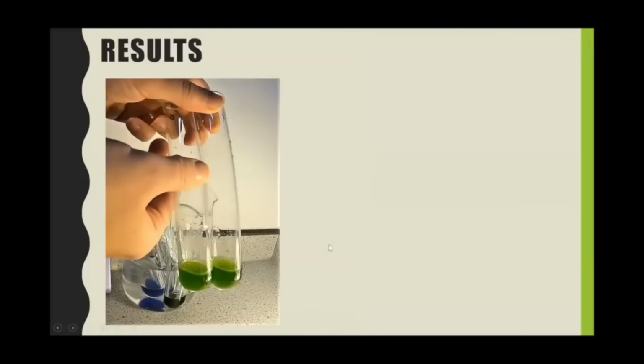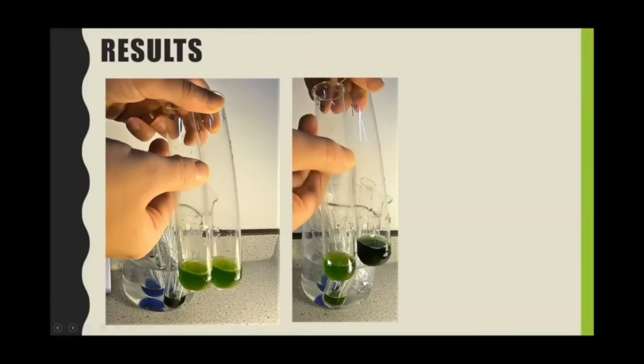My actual results: here I am comparing the X test tube, which is experimental tube 1, with my standard test tube, and I can see they're now exactly the same colour. So the DCPIP was decolorized, and that was the endpoint of my reaction. Experimental test tube 2, this is the start colour. It never actually changed. It's still got that dark greeny blue because it's a mixture of the blue DCPIP and the green chloroplast suspension. So this one didn't change colour. I recorded that as no change, and in terms of the rate of reaction, that was 0.